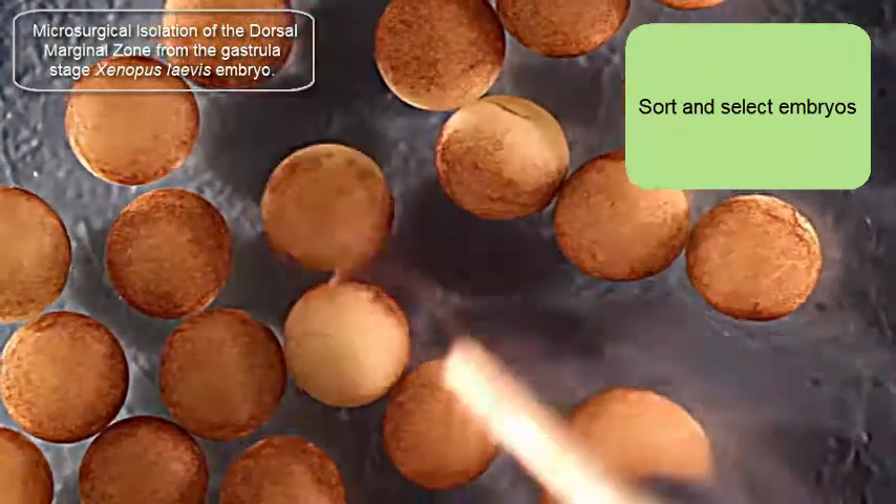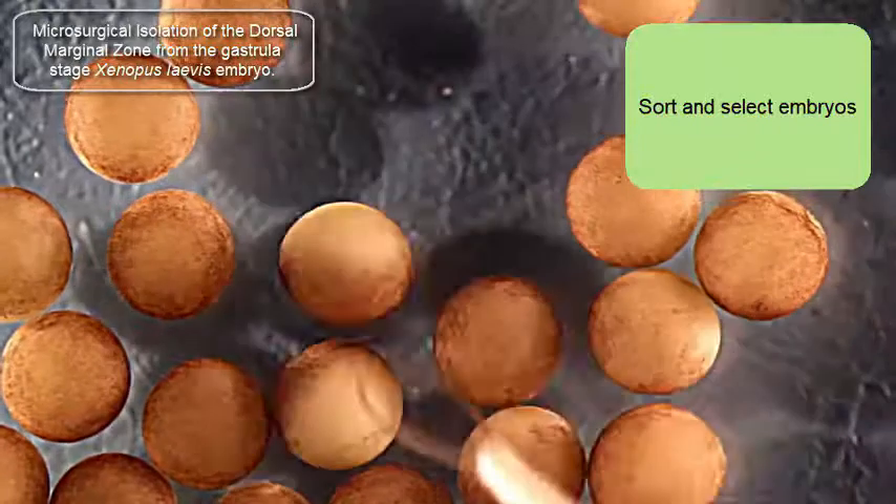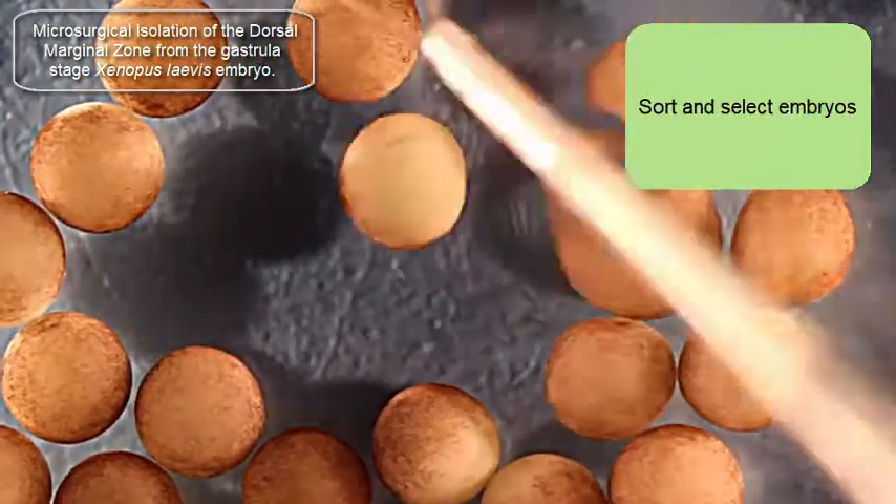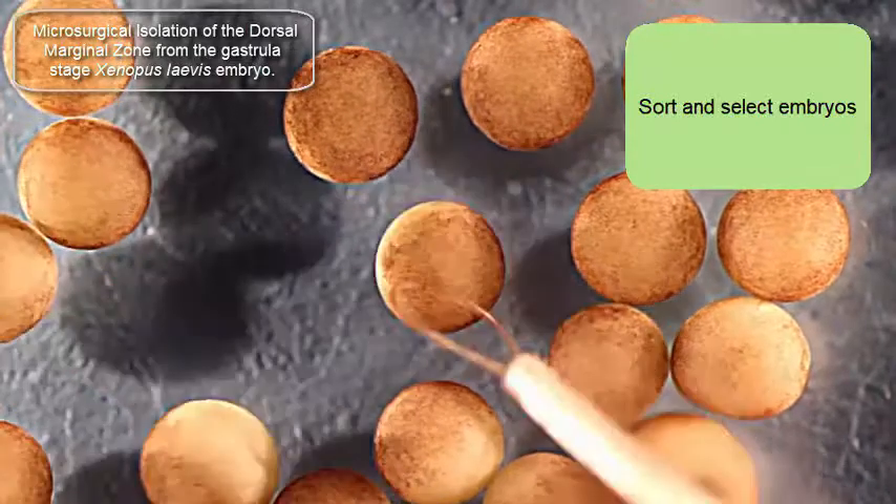In this video I'm going to isolate the dorsal marginal zone from a gastrula-stage Xenopus laevis embryo, from a single Xenopus laevis embryo.